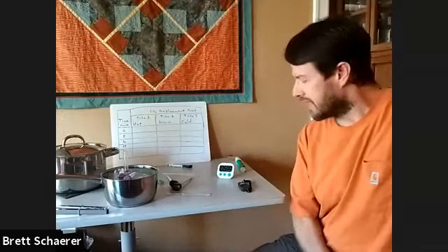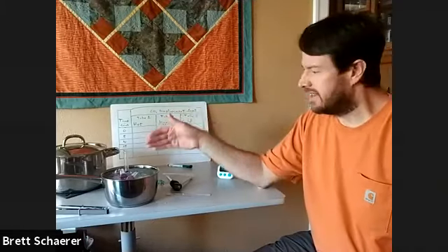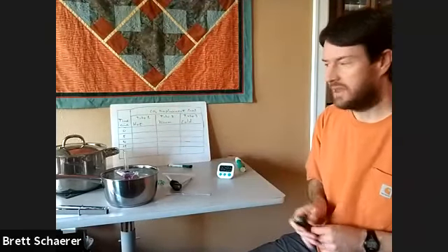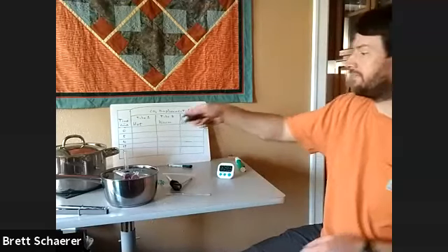All right, so it looks like it's been 5 minutes here. We are going to assume that the yeast and glucose have come to temperature. They have equilibrated with their environments. Same for the fermentation tubes. Before I start mixing things and start the fermentation experiment, I want to get a reading of the temperatures. I'm going to use this infrared thermometer.